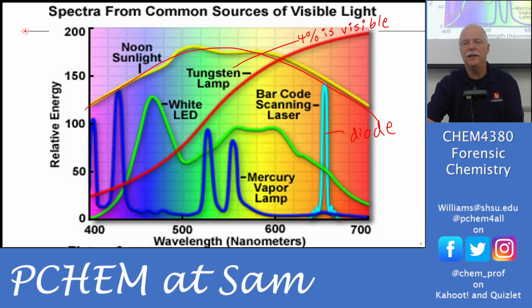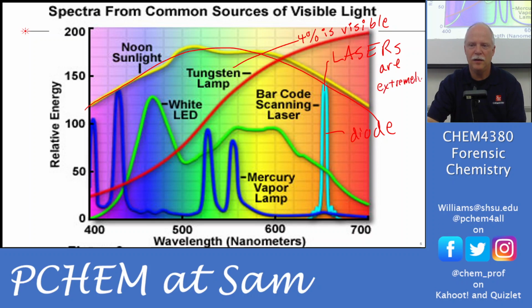And the laser makes it extremely bright. So at the given wavelength for that laser, it's going to be off scale. In fact, this has probably been filtered down.